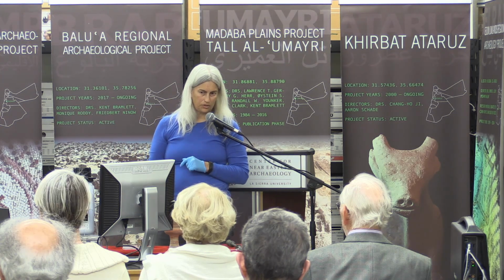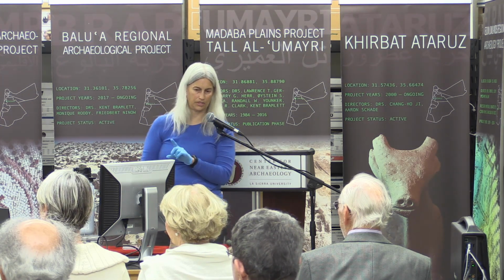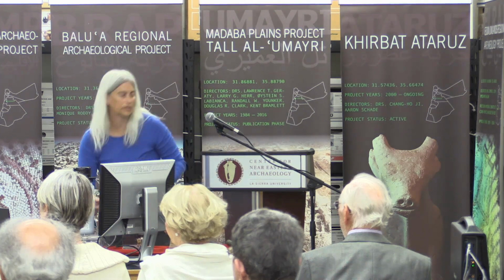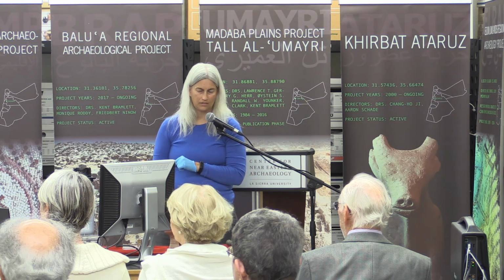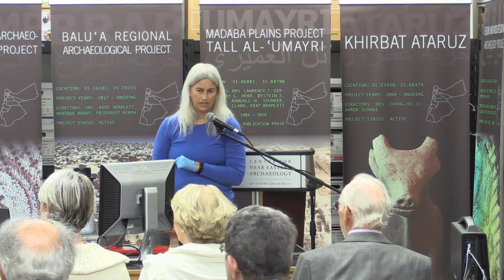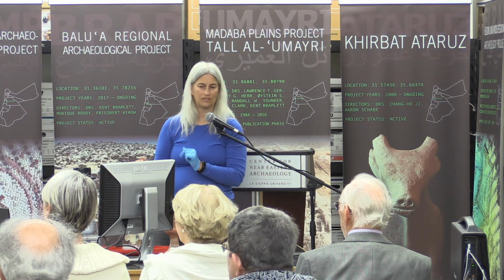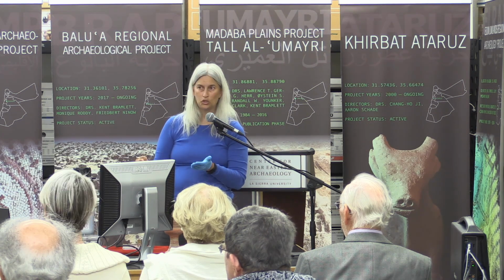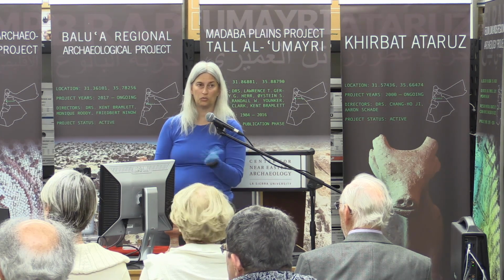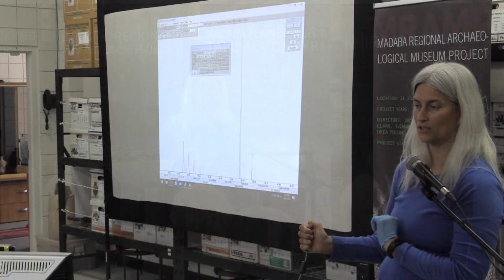Okay, so now watch for the new peaks, because the old ones are going to be in blue. It's coming up. And the new ones are in red. Are our new red peaks in the same place as our blue ones? Oh, yeah. Even though they look very similar to what we would expect to be a copper color, it's clearly not copper.